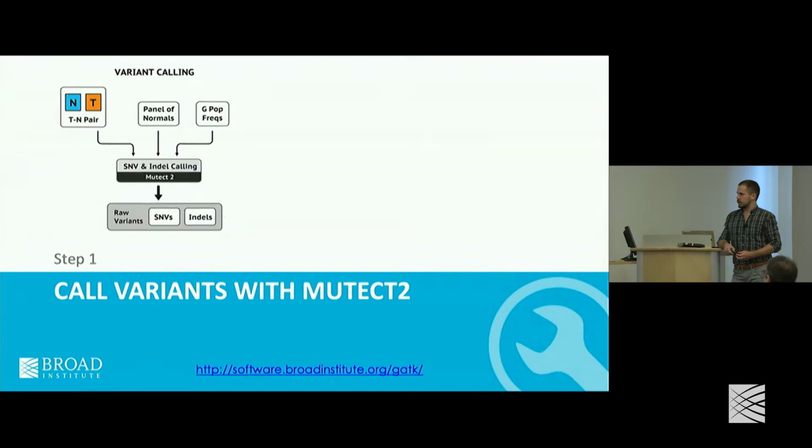But in a later filtering step, it'll be less naive, and we will, for example, say, oh, well, all of those actually show that variant comes from the same strand, for example, or it comes from one end of the read, and so we'll filter it out.